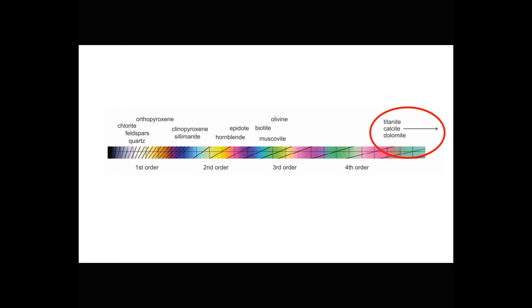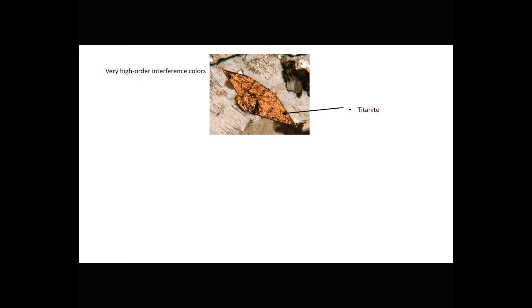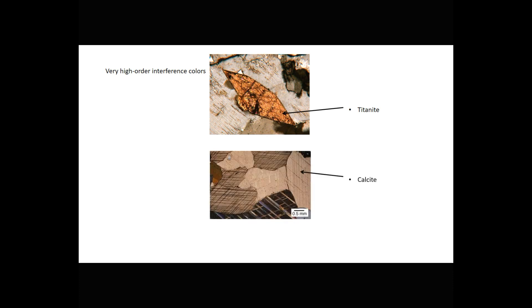Some minerals have such high birefringence that interference colors do not plot on any normal chart. Titanite, calcite, and dolomite are good examples. Here we see a grain of titanite — the birefringence is so high it's really hard to tell what the interference colors actually are. If we wanted to plot titanite's birefringence on the chart, the chart would have to be three times wider. Titanite often shows this classic wedge shape called a sphenoid shape, and the old name of titanite was sphene. Calcite has even greater birefringence than titanite, and both have extremely high-order interference colors — so high that we can't even estimate what order they are, and sometimes these colors appear almost white.